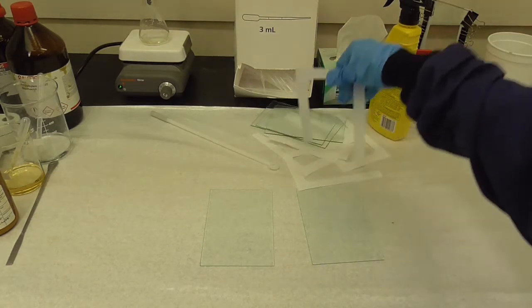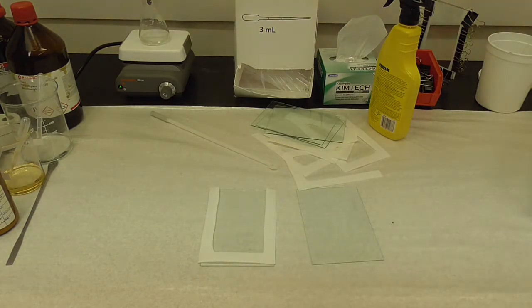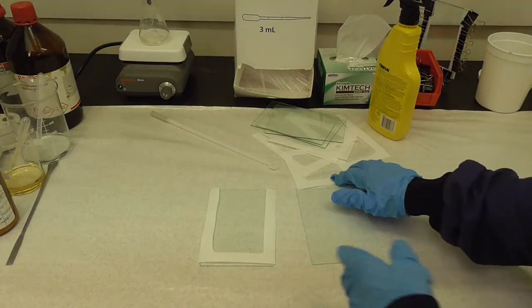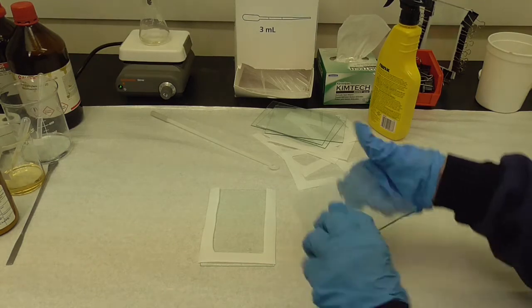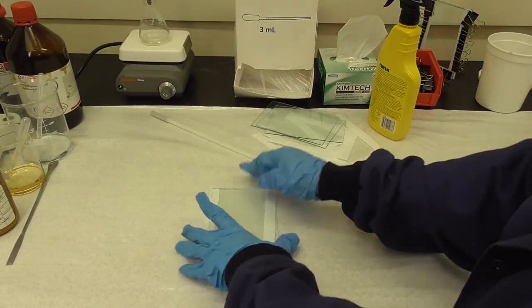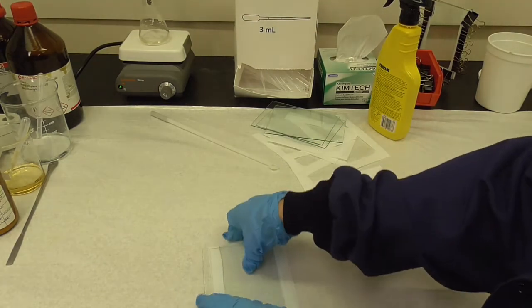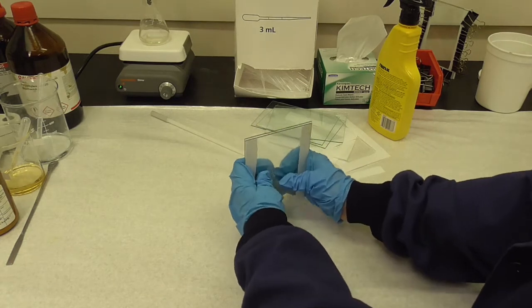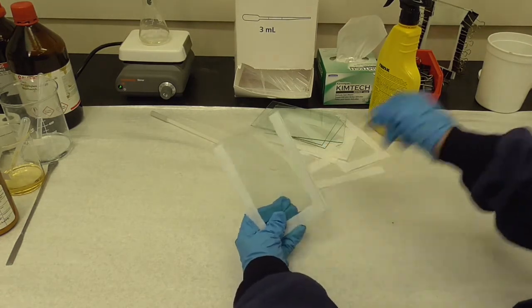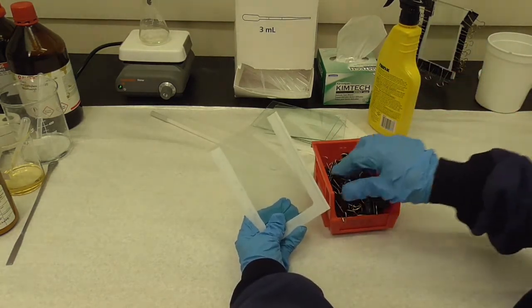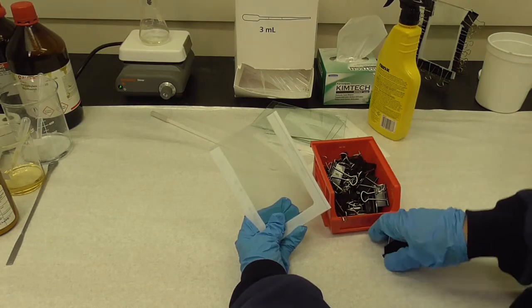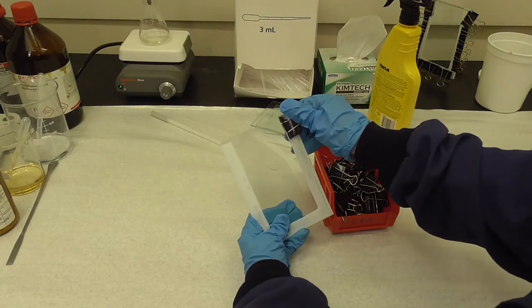Now we're going to put a piece of Teflon here between the two pieces of glass. It makes a spacer and then we use the clamps to clamp around the perimeter.